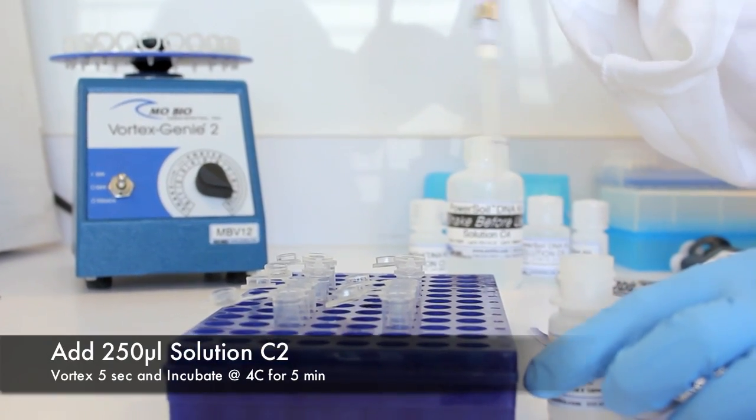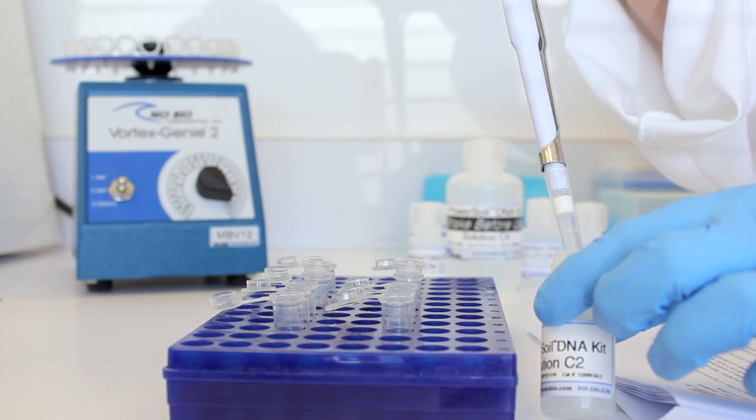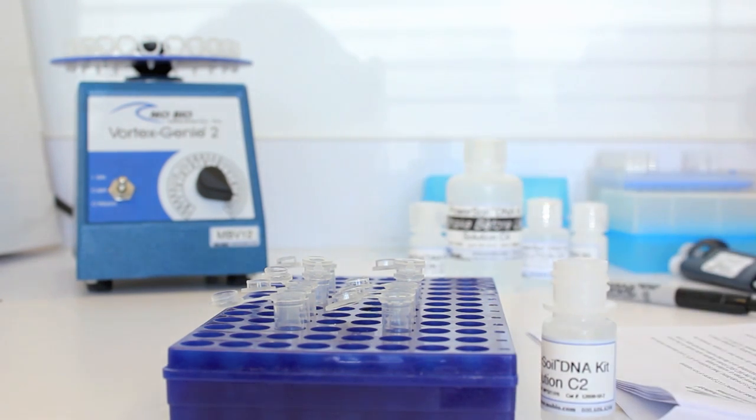Add 250 microliters of solution C2 and vortex for 5 seconds. Incubate at 4 degrees Celsius for 5 minutes, followed by centrifugation.